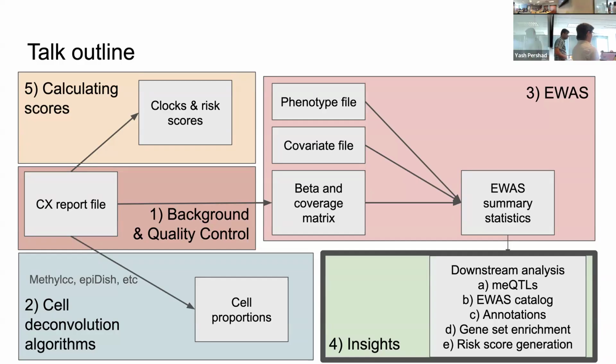The linear models or whatever models you run will obviously kick out any missing sites. However, that should be a very, very small percentage of sites across all of your samples for any given CpG in the Twist methylation file. A quality control metric I would look at is whether you have a CpG site with really high missingness, like over 10% across your samples. I would probably go ahead and throw that out, but you'll look at the distribution.